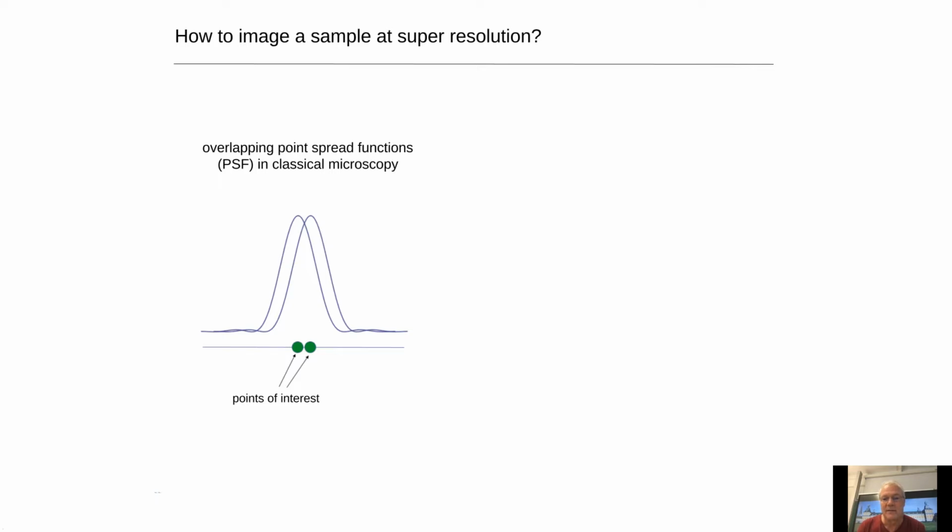So far we saw how we can acquire optical sections at high speed from samples, also from extended samples, because with that fast imaging technique we can achieve high frame rates. But still we didn't talk about the problem of how to reach the necessary resolution, because in such samples we usually have to use low NA objective lenses, and these have a low optical resolution. So what options exist in order to image points of interest that are close together so that their diffracted images overlap, as shown here in that sketch?